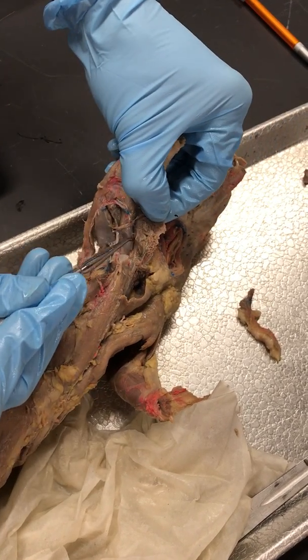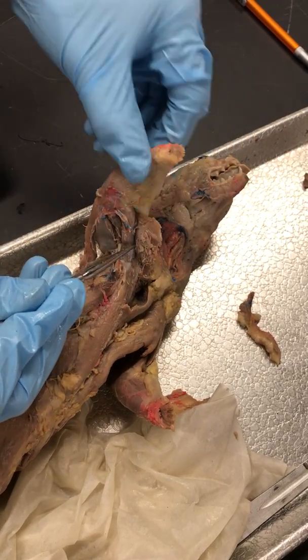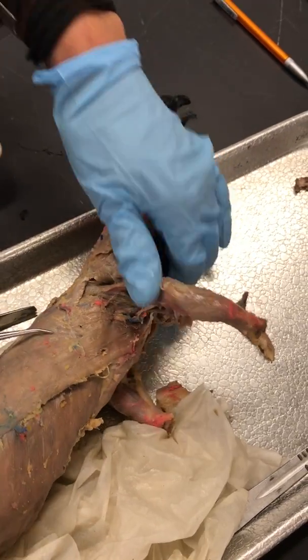And then this is Biceps Brachii here. And one more — the Scapulodeltoid, that was the long skinny one.